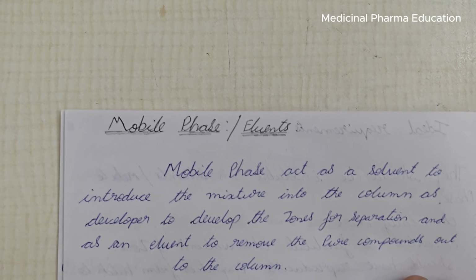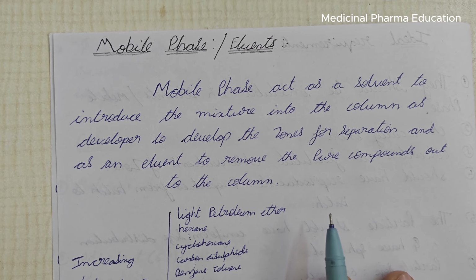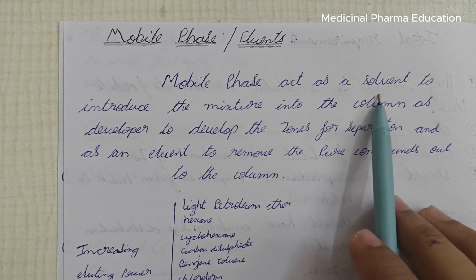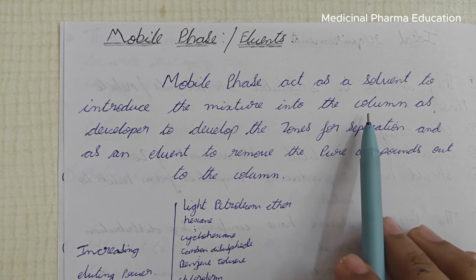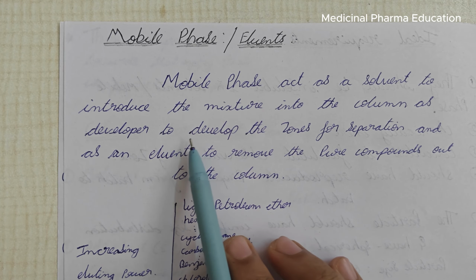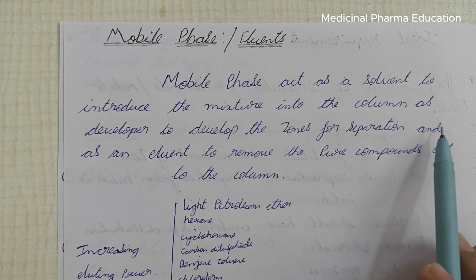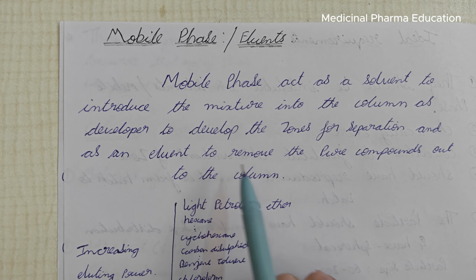Next we'll study the different types of mobile phase. We have studied the stationary phase. Now the mobile phase acts as the solvent to introduce the mixture into the column, as a developer to develop the zones for separation, and as an eluent to remove the pure compounds out of the column.